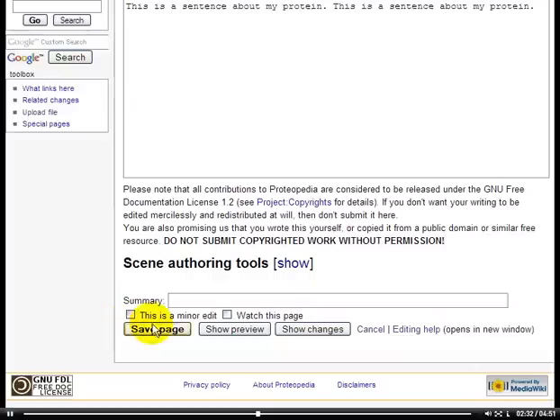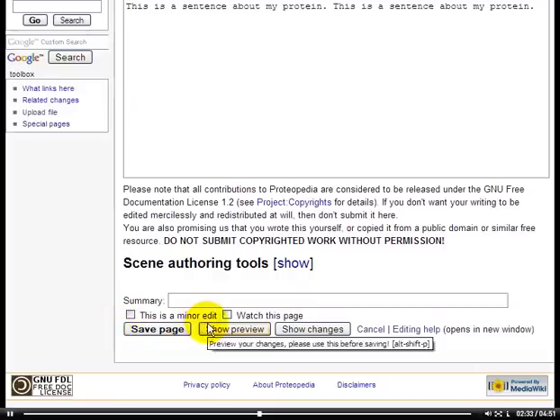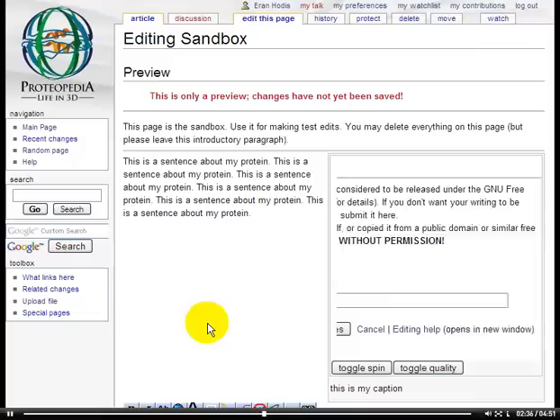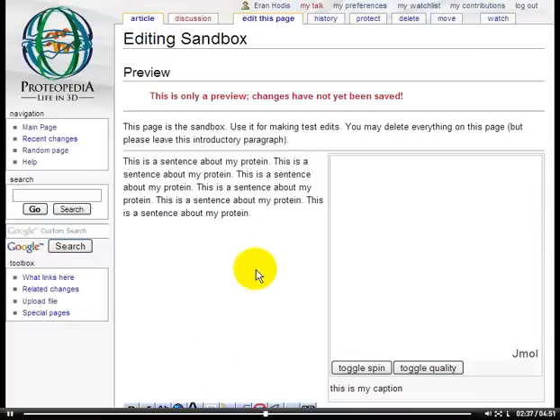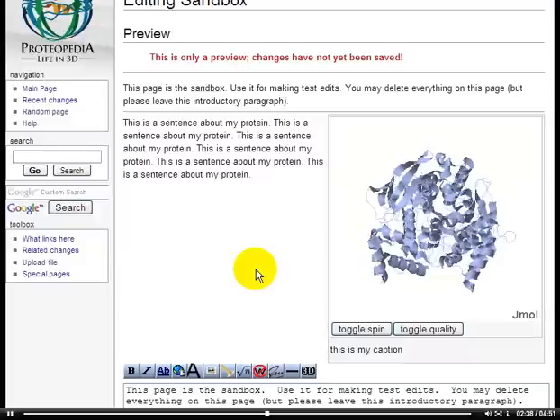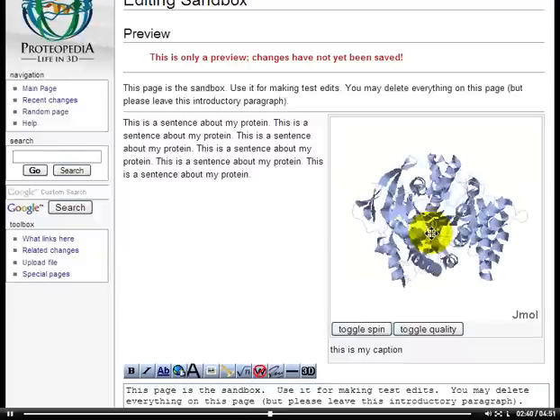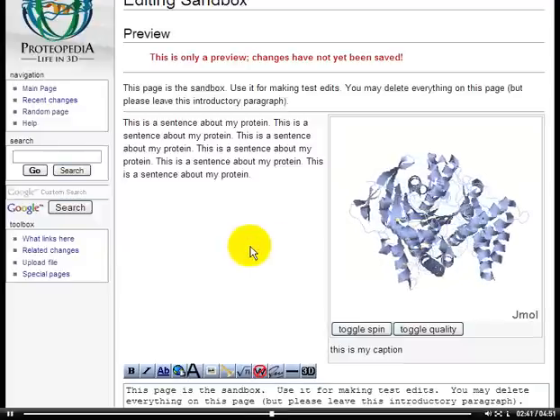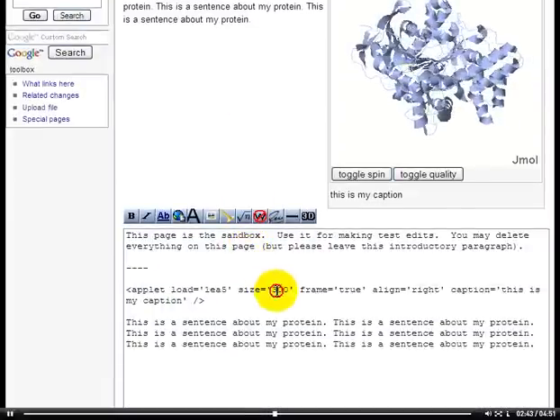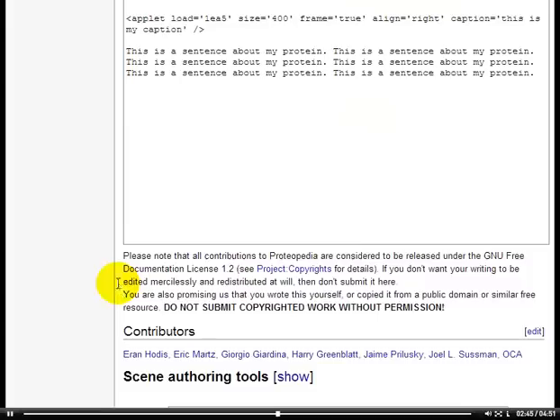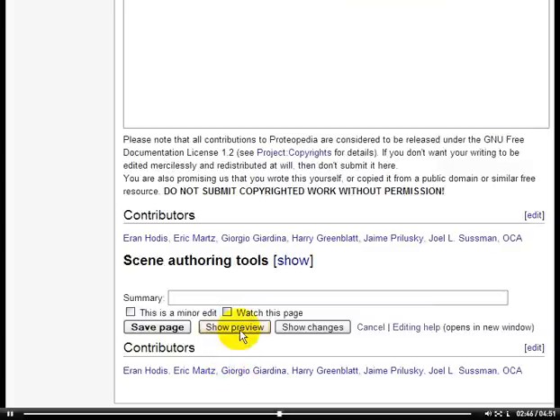So let's preview that and see how it looks. Voila, we have our applet on the page here in this preview. Maybe it's too small, so I can change the size to 400 and preview that.